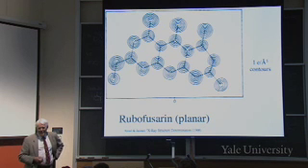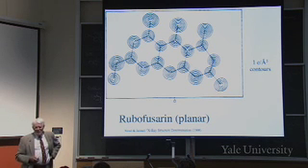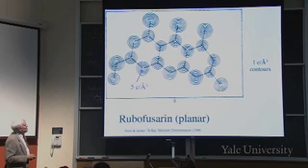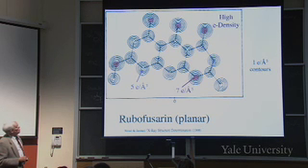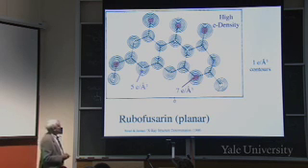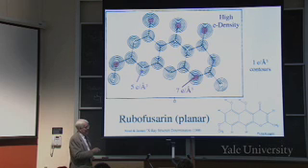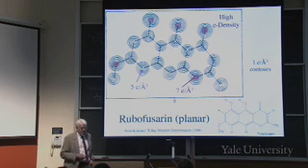They're more electronegative, so they should have more contour lines. So if we look here, we see that that one goes up to 5 electrons per cubic angstrom, 1, 2, 3, 4, 5 rings, right? That one goes up to 7 electrons per cubic angstrom, and so do those, right? So those are the oxygens, okay? And there's a picture of the structure, and you see, indeed, those atoms are oxygens, right?